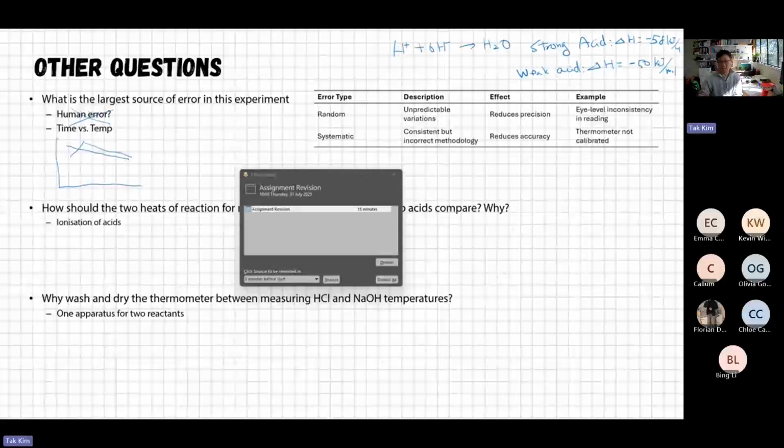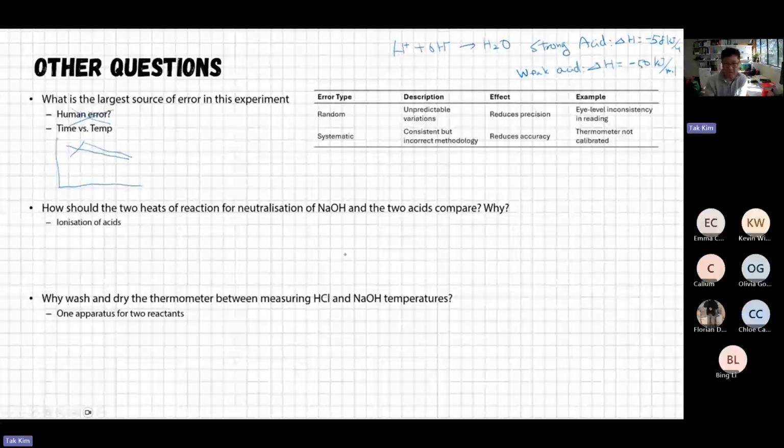So your value can be larger than the value over here. It also depends on the calibration. If you made a few mistakes, you're going to lose a lot of energy through the calorimeter. And once you put those into account, your value might be higher than this value. So this is a theoretical value, and you really cannot have a value larger than the theoretical value.